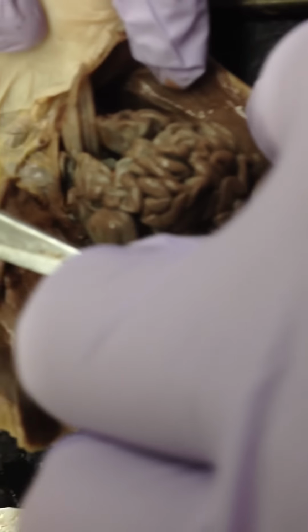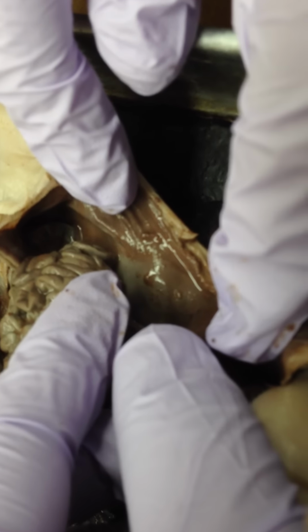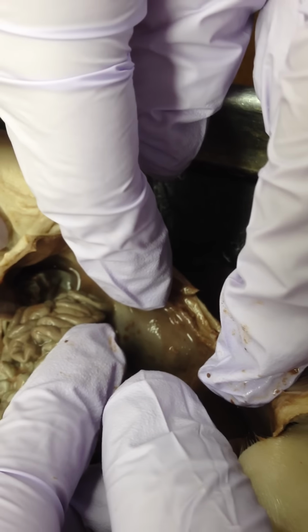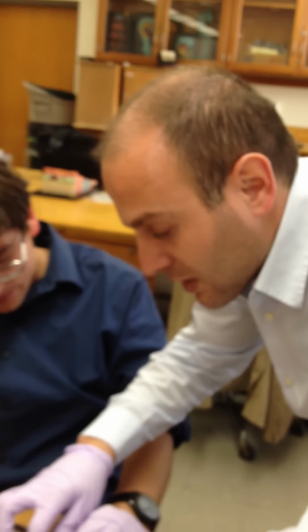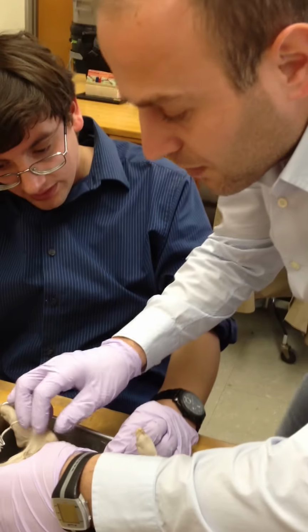All right, so here you can give an example of the kidneys, but also make sure that you talk about retroperitoneal organs like the kidney, where the peritoneal layer covers part of the kidney, but the rest of it is on the back, on the dorsal side of the peritoneal cavity. And the other side is covered with adventitia, which is a specific type of connective tissue surrounding the kidney.